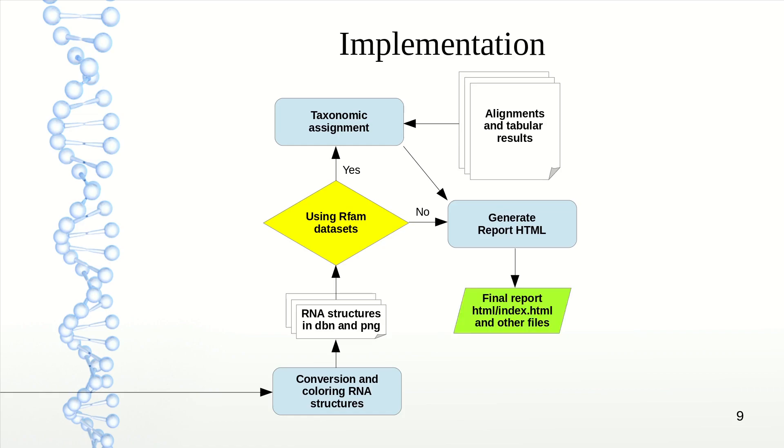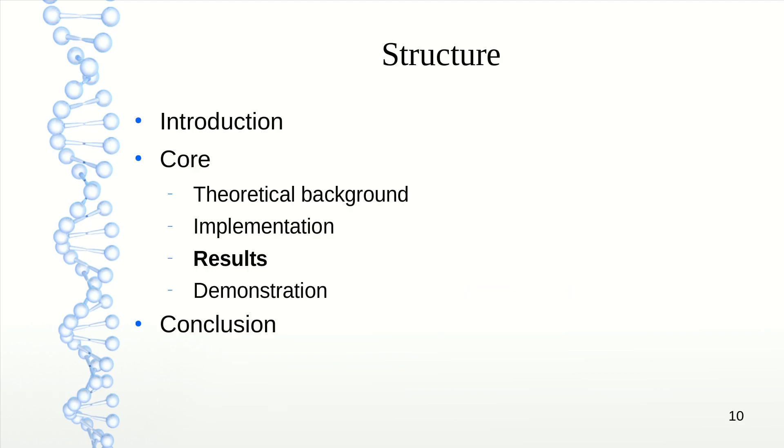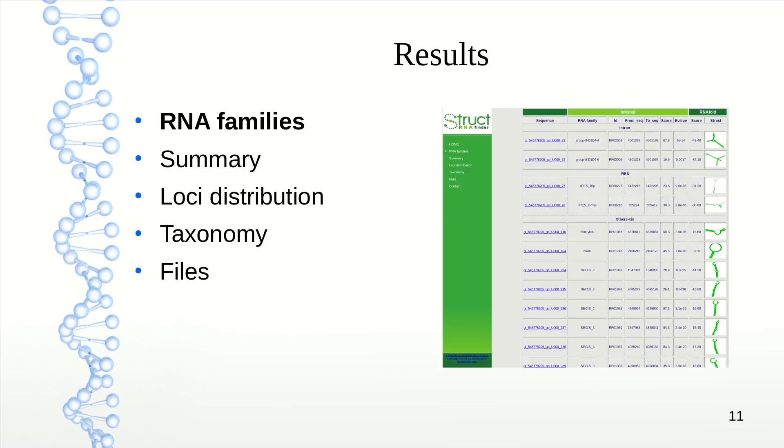Finally, we have our final report, which will be an HTML file that is easy to view and read. What does this result look like? The RNA families section shows all the sequences found, allocating each a unique name, the RNA family they belong to, and the family ID.